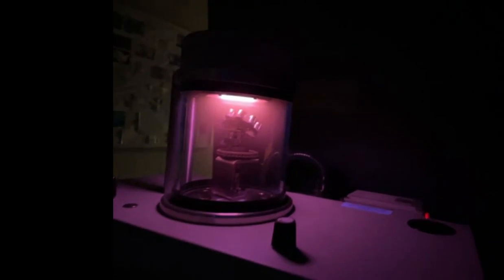Sometimes it looks better in the dark. So you can kind of see what's going on. The plasma cloud comes down to about halfway through the chamber, and the samples are way up in that cloud. So when they're done preparing, they'll be covered with a fine layer of gold. Roughly a minute and a half. I suspect it's another 30 seconds or so.